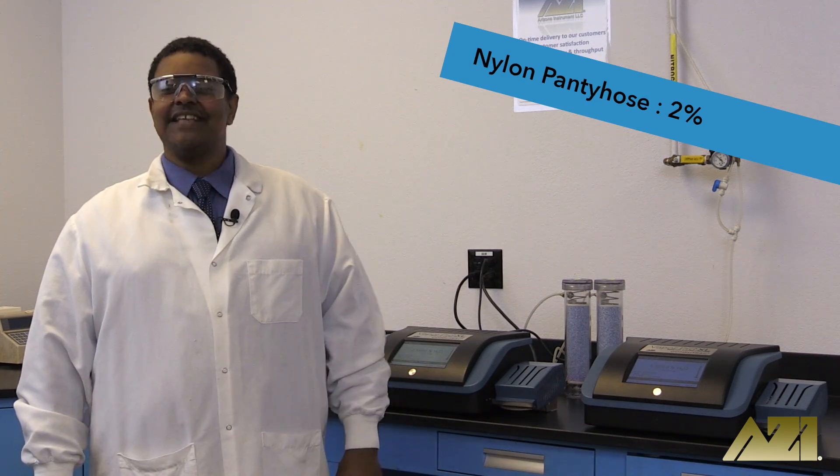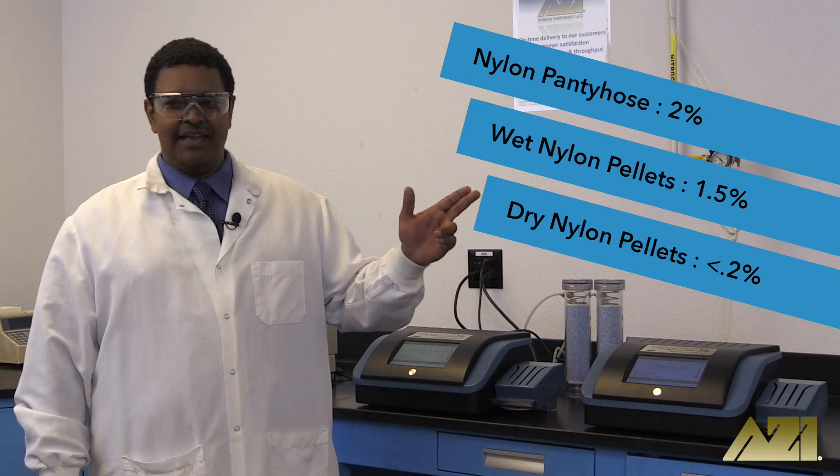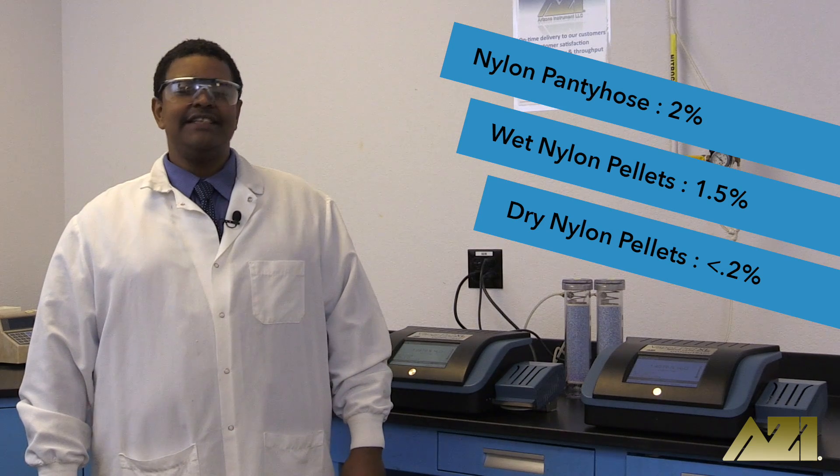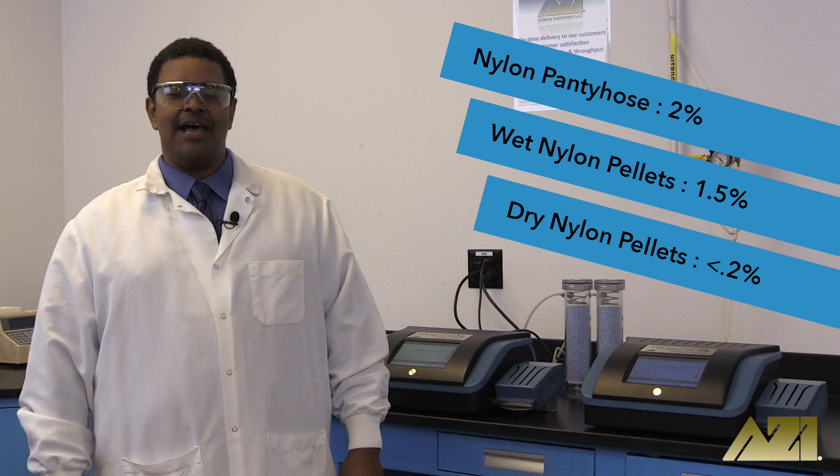It's obvious from our test that the nylon pantyhose has a higher moisture content than either the wet or dry nylon pellets. The pantyhose came in at about 2% moisture, 10 times more than the dry nylon pellets.